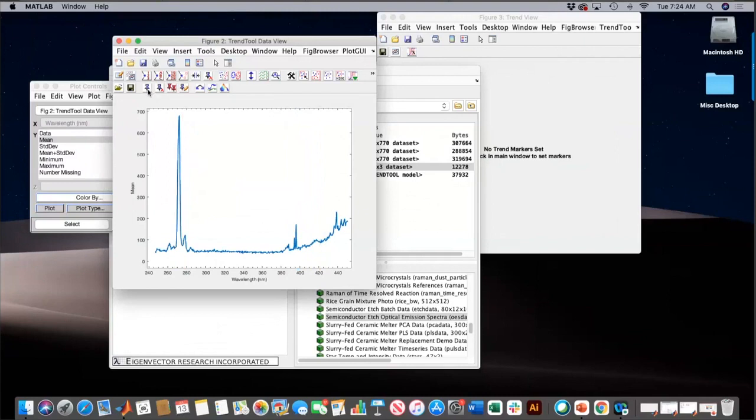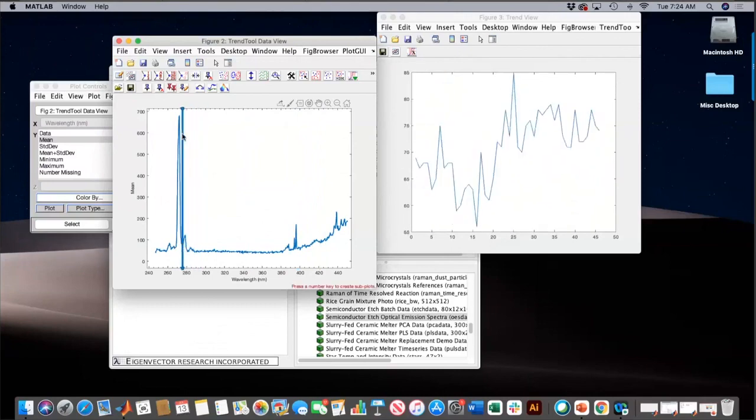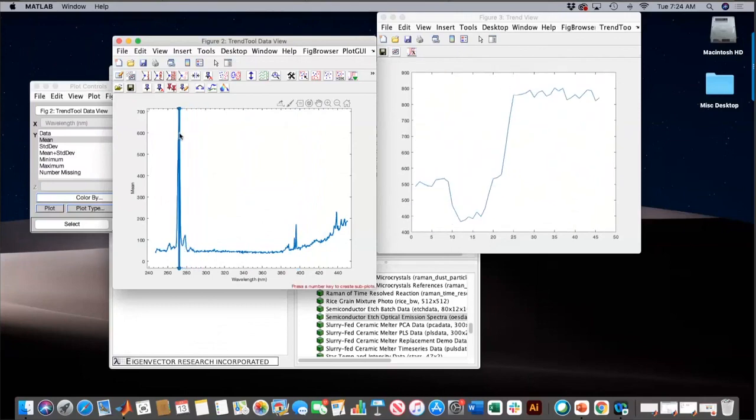And let's say that I want to do this, and I can add a reference. So add reference. If I do that and add a single point reference, then that's taking this now reference to that.